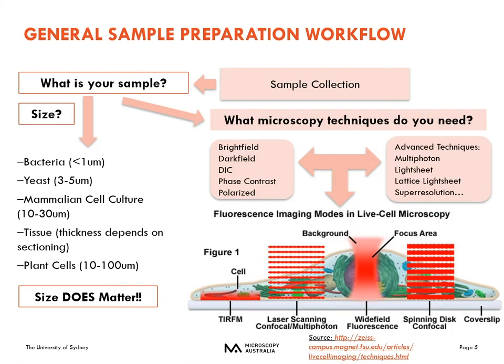The next question is, what microscopy techniques do you need? If you want to use bright field, you can use different contrast methods, including bright field, dark field, DIC, phase contrast, or polarized light. Or you may want to use fluorescence microscopy, which might be wide field fluorescence, laser scanning confocal, spinning disc confocal, or even TIRF. More advanced techniques include multiphoton, for intravital imaging or thick tissue imaging, light sheet, lattice light sheet, or even super resolution, which include special sample preparation techniques.